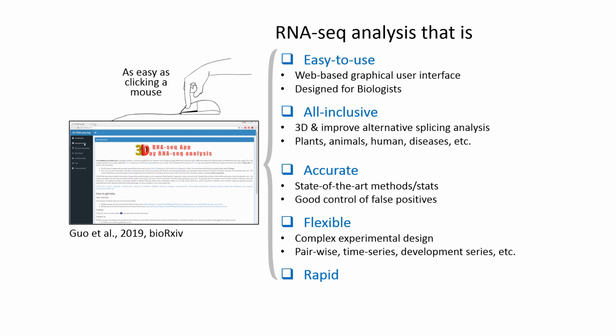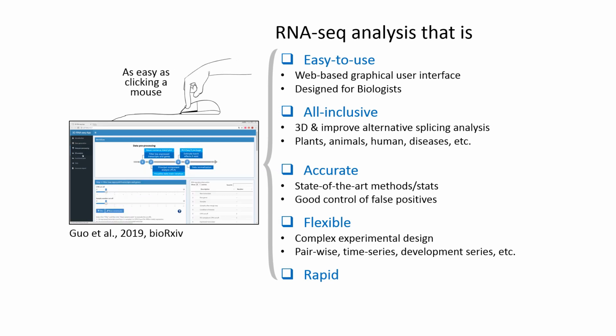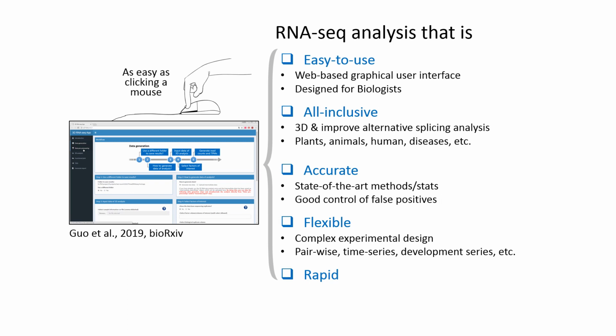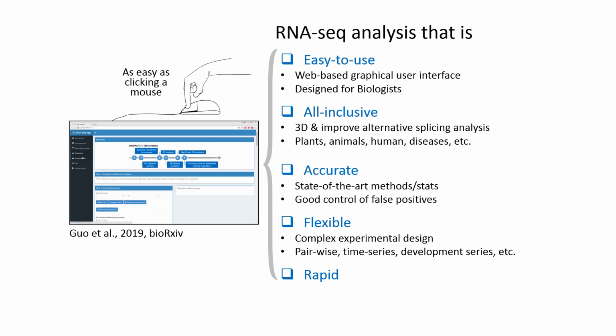It is very accurate and has good control of false positives. It's very flexible to complex experimental designs, such as pairwise, time series, and development series datasets. The analysis is very rapid using the 3D app.